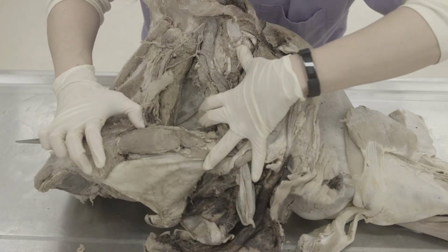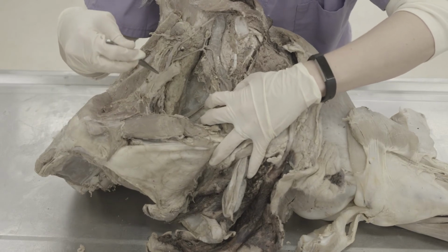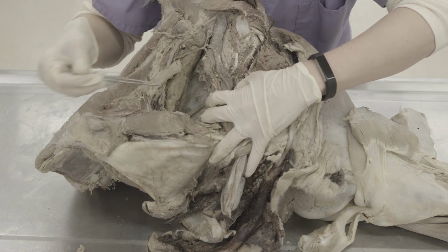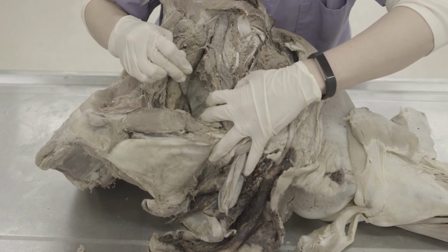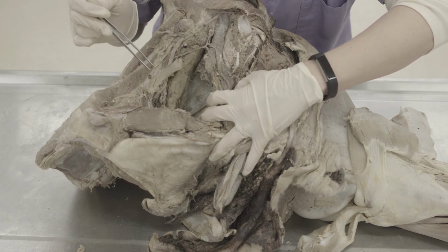Now if you want to look for the obturator nerve from this hole that you made by removing the pelvis, you can do that, and it might be a little bit easier, or you may be able to just trace it more easily. You're seeing that obturator nerve right here. This would be the right side, the right obturator nerve, and it's going through the obturator foramen of the pelvis on the right side.